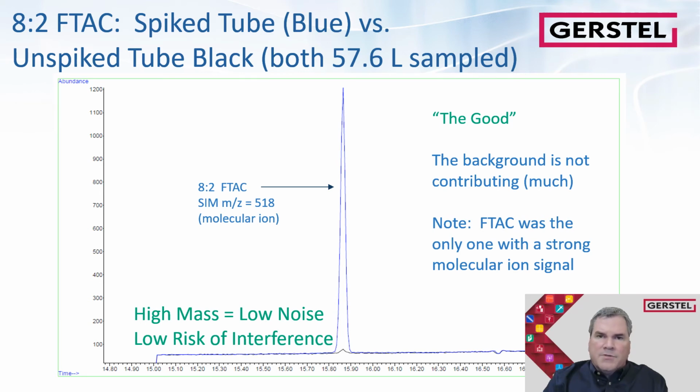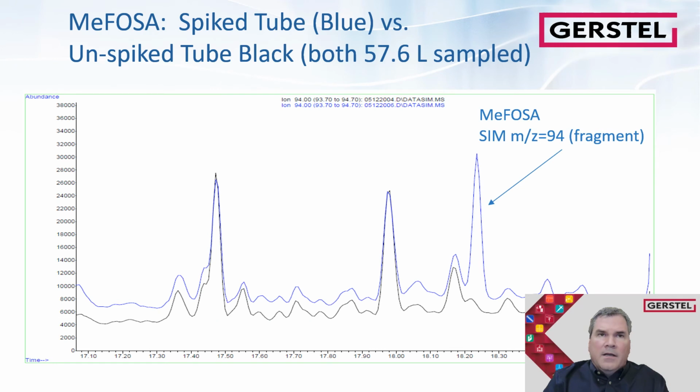The low noise, of course, is going to mean great detection limits. Unfortunately, that was, again, the only one that behaved well.